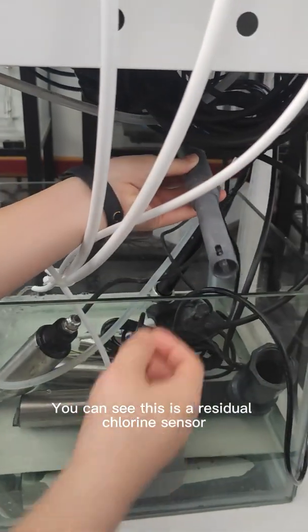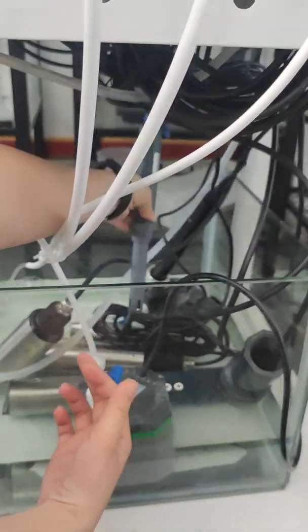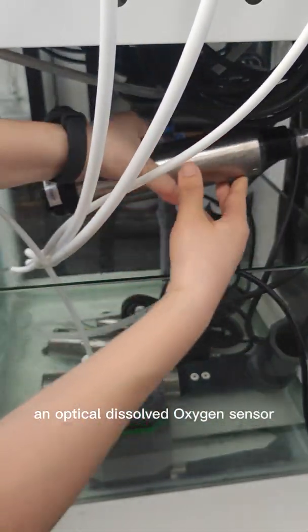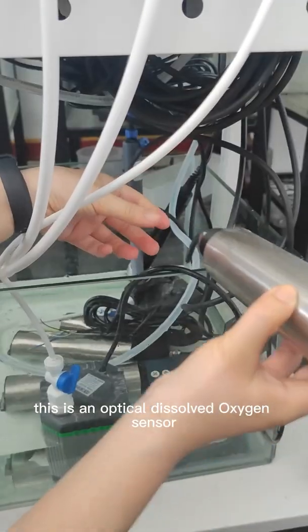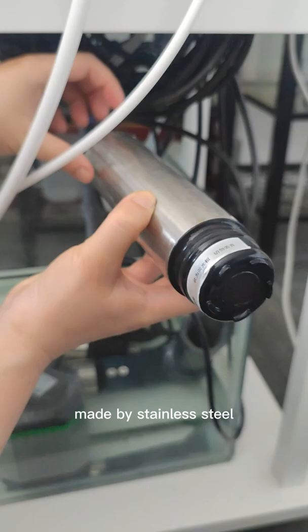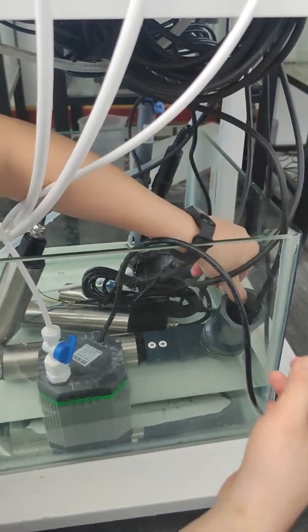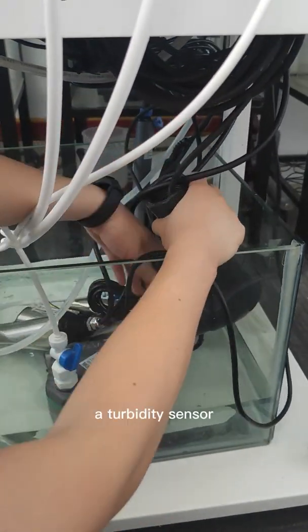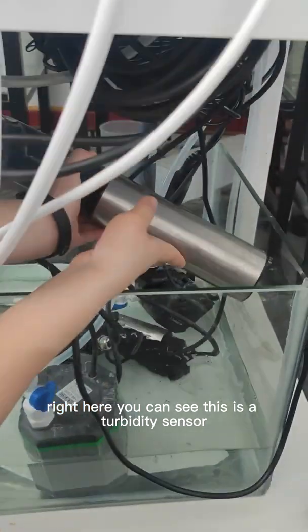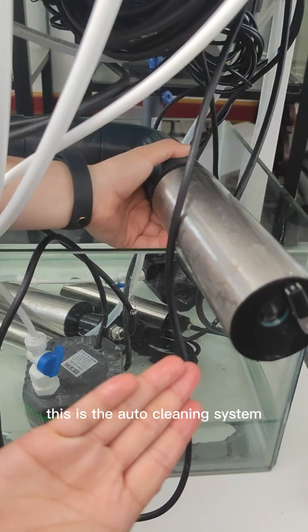You can see this is a residual chlorine sensor under testing and an optical dissolved oxygen sensor. This is an optical dissolved oxygen sensor made by stainless steel material. And this is a turbidity sensor right here. You can see this is a turbidity sensor with an auto-cleaning system.